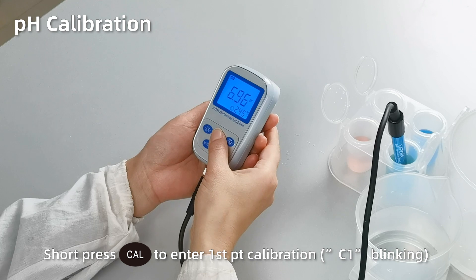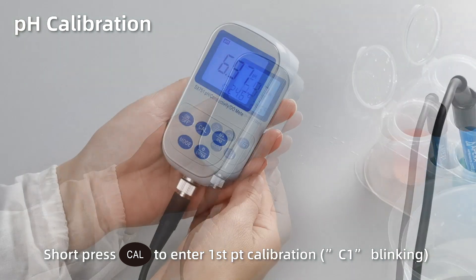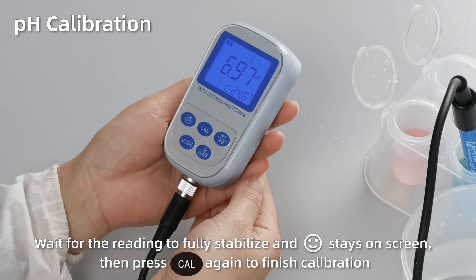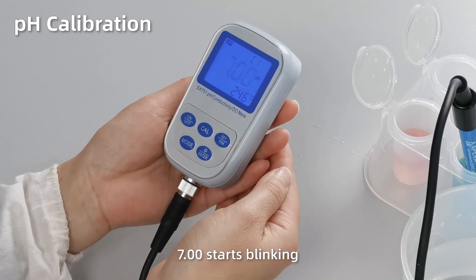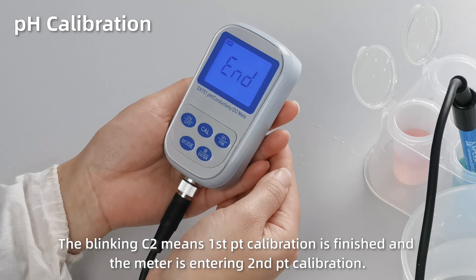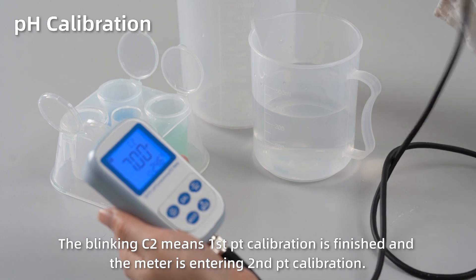Short press Cal to enter first point calibration — C1 starts blinking. When the reading gets fully stabilized and the smiley face stays on screen, press Cal again to finish the first point calibration. 7.00 starts blinking. The blinking C2 means the first point calibration is finished and the meter is entering second point calibration.